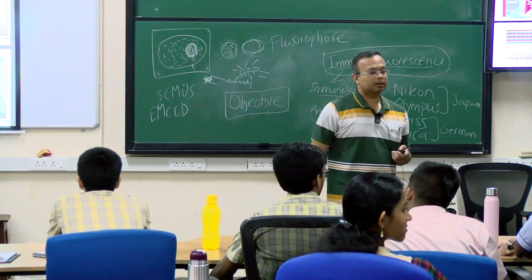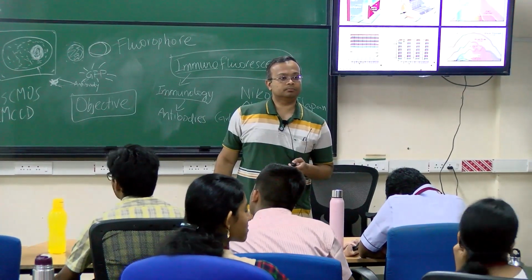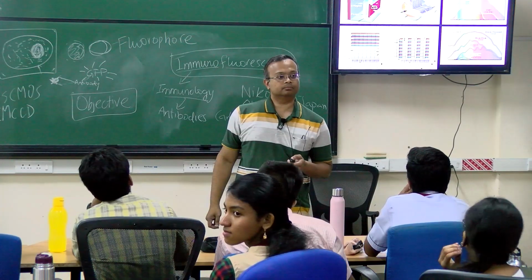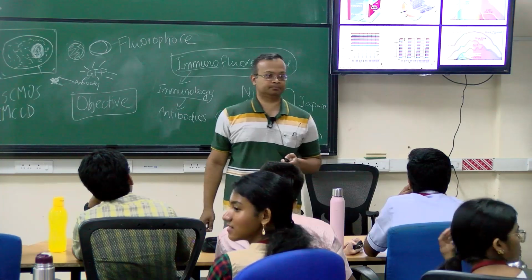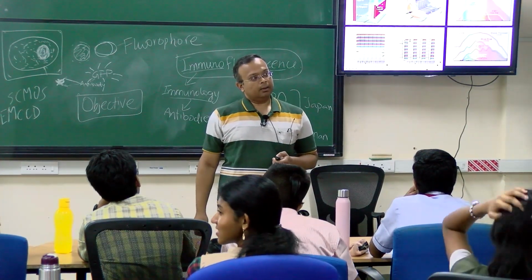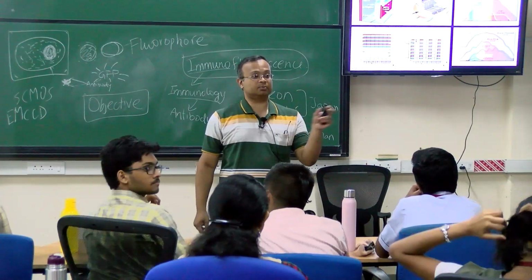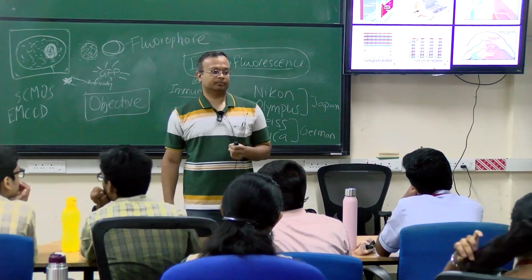Here you're only talking about CCD image sensors, but isn't it the case that over the past decade all CCD sensors have been replaced by CMOS sensors? Yes, that's correct. So in the lab, do you still use CCDs or CMOS? In certain applications CCDs are important, especially when you have to capture fast moving objects. Then CCD is better than CMOS.